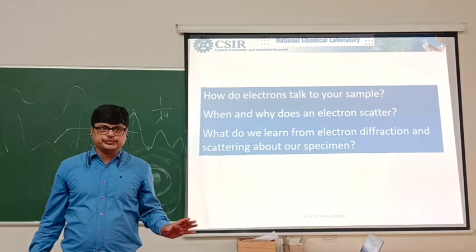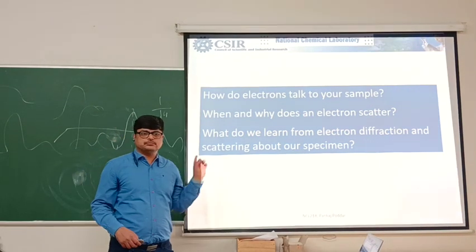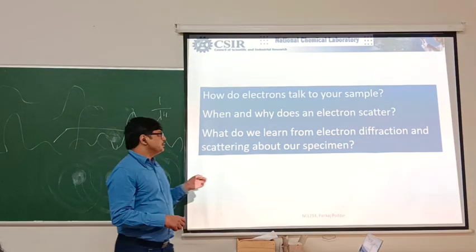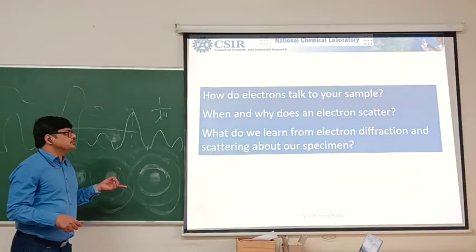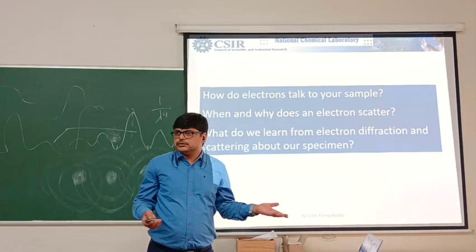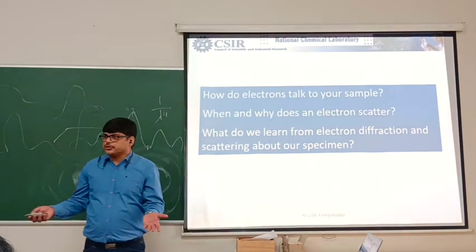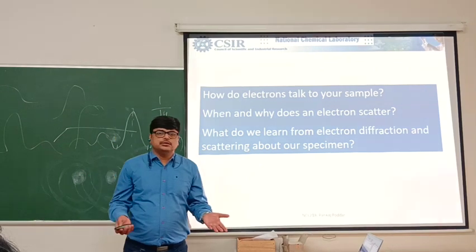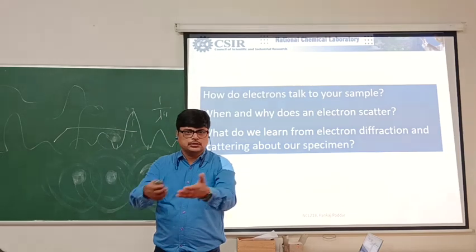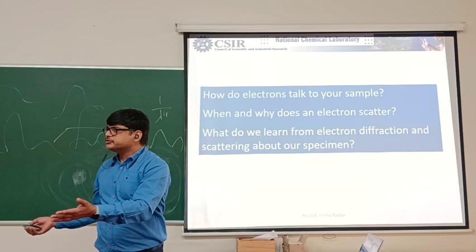So nothing is actually new, right? First question we already addressed in the first class. Second question also, if you remember. And third question, what do we learn? That was also answered in the first class. We learned about topography, we learned about crystallography, how the atoms are arranged in the lattice, and where is the vacancy, and what kind of atoms are present.